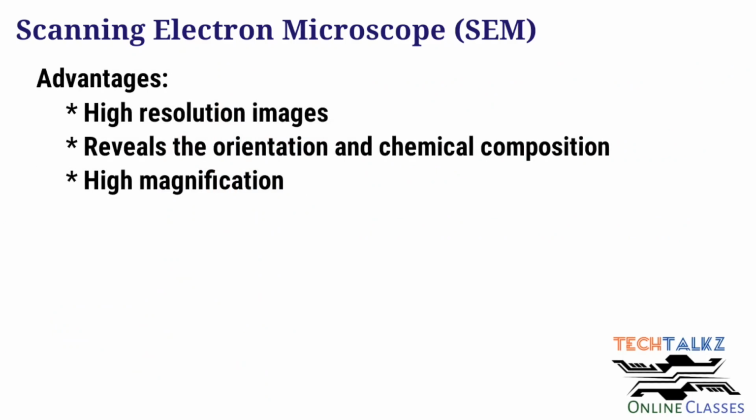Okay. Now we can see the advantages of SEM. It will generate high resolution images and also reveals the atomic orientation and the chemical composition. And SEM has a high magnification rate when compared with normal microscopes.